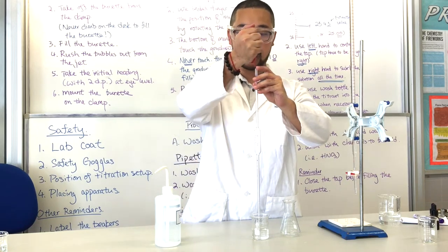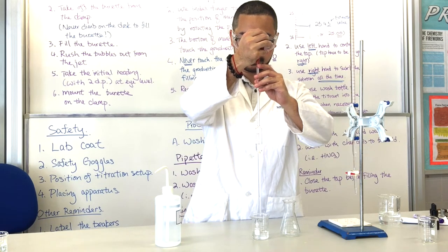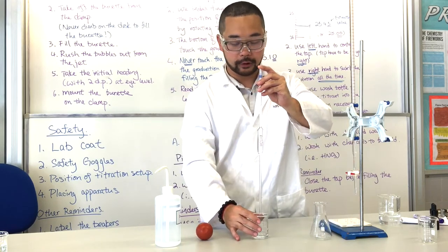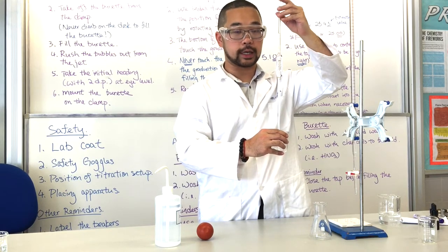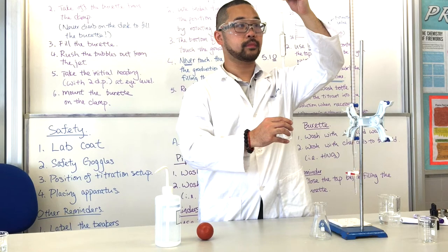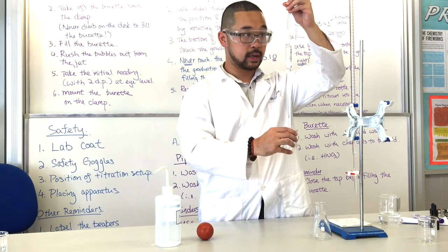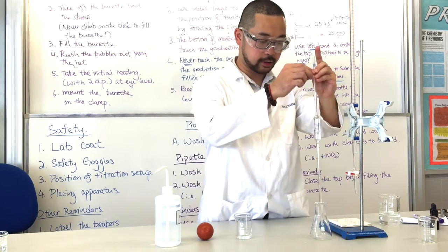So what you do right now is use a pipette filler to draw up the solution. Right after that, reading the meniscus, we have to do it at eye level. So you need to take out the whole setup, cover it with your index finger, and slowly rotate the pipette. By doing this, you can see that the meniscus is going down. When it touches the graduation mark, you can transfer the liquid to the conical flask.